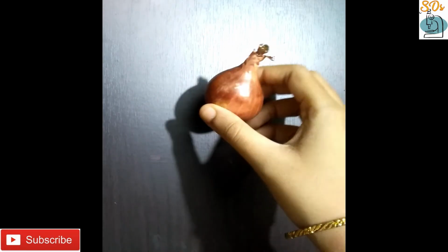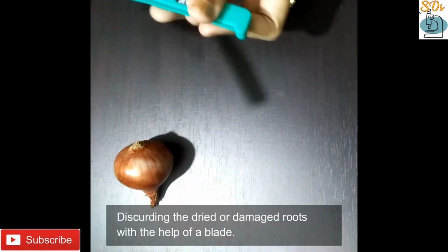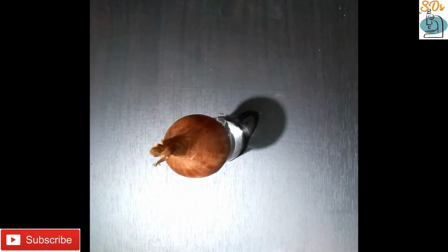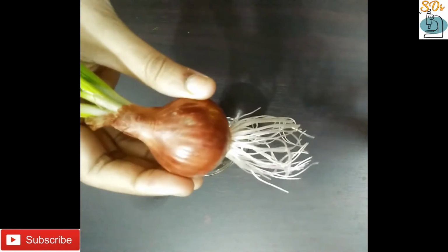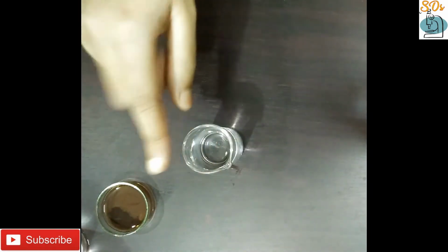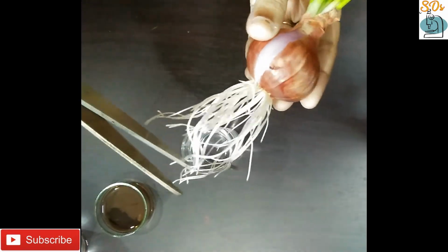Now going to the experiment part. This is an onion. Look, everybody will know this is an onion. I kept it in a glass beaker for 4 to 6 days for new roots to grow and appear. After 6 days, look, these are the roots and shoots developed. Too many roots developed and shoots also developed in 6 days in the onion. So now trim around 3 cm of the newly grown roots and place them in a watch glass. Here I have kept it in the glass beaker.